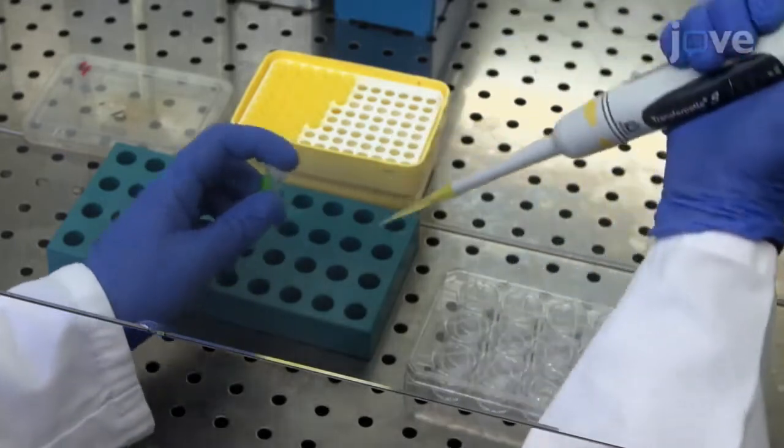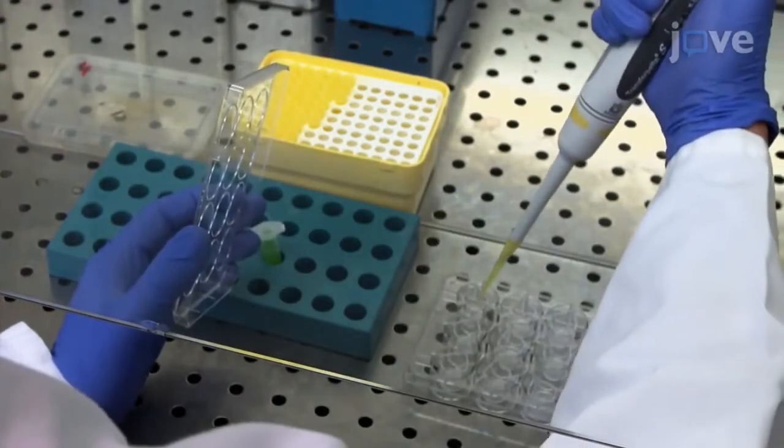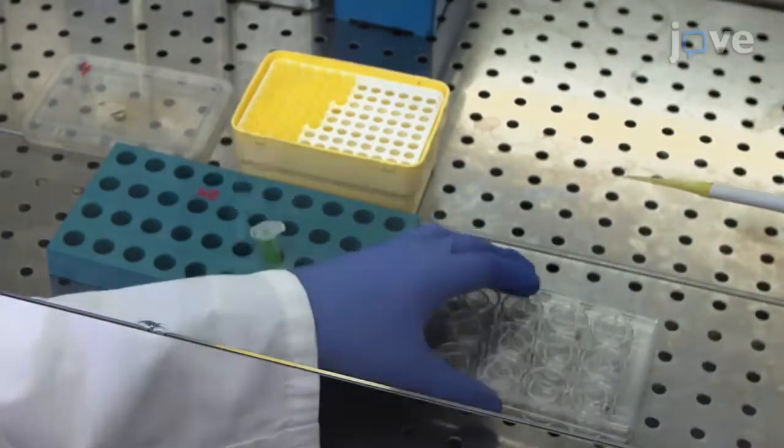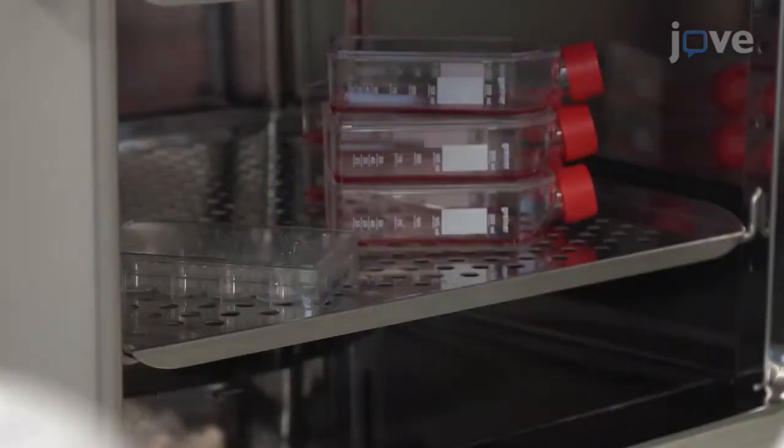Coat the porous membrane of each insert with 90 microliters of 10 micrograms per milliliter collagen 4 and fibronectin mixture and incubate the plate in a cell culture incubator at 37 degrees Celsius for 24 hours.